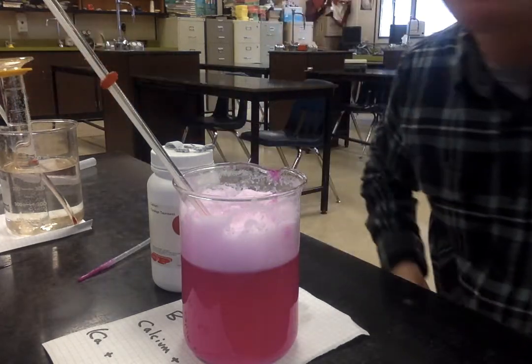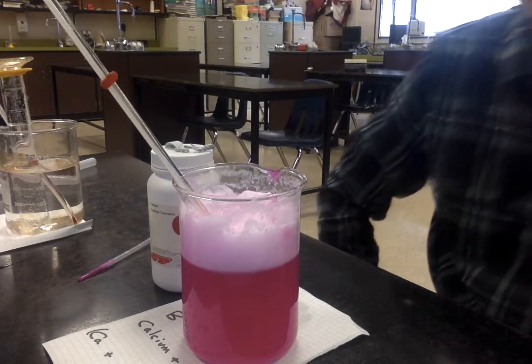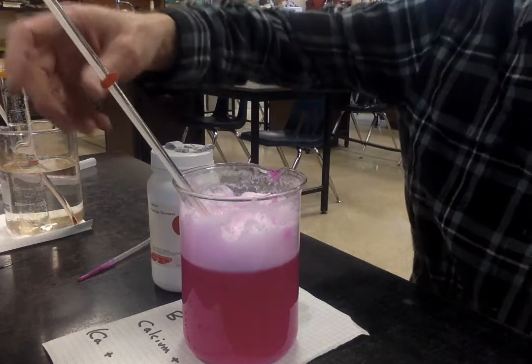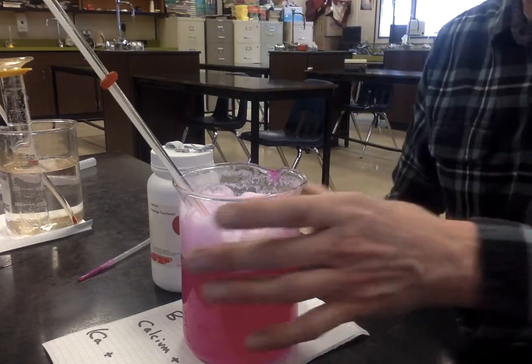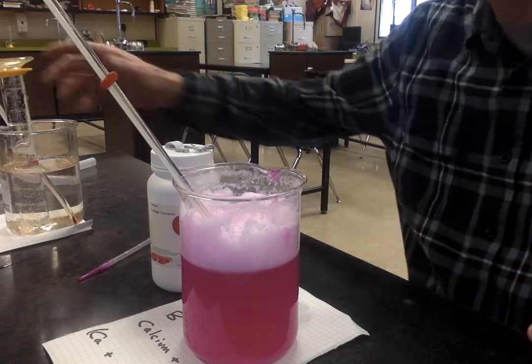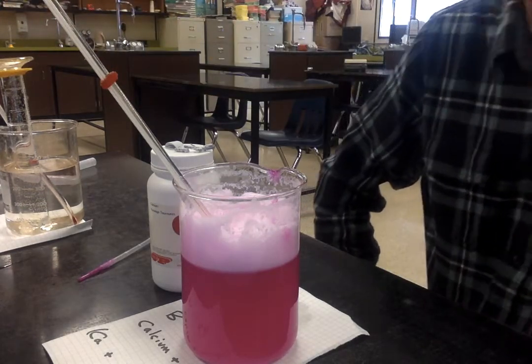The temperature in the zinc beaker is still stable at 20 degrees. Gas is still being produced. All right, so I think that we're good for that. I might follow this up with another short experiment involving the calcium. Is anything happening with the zinc? Probably not. I could show it to you, but it looks exactly the same as when we started.